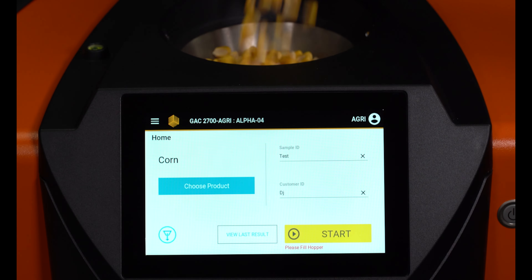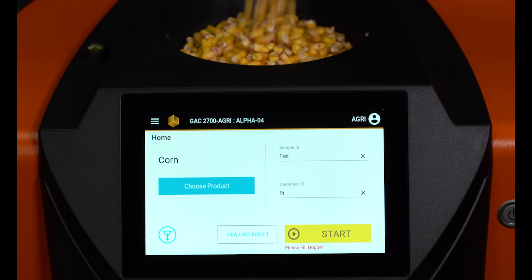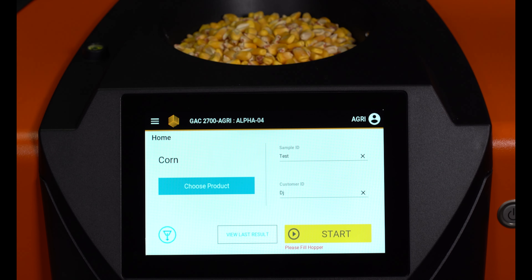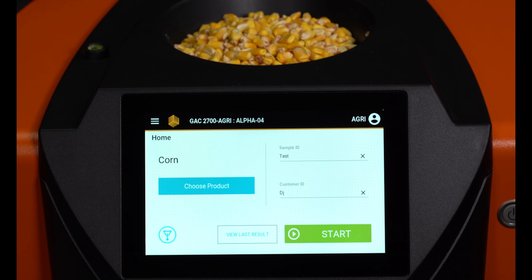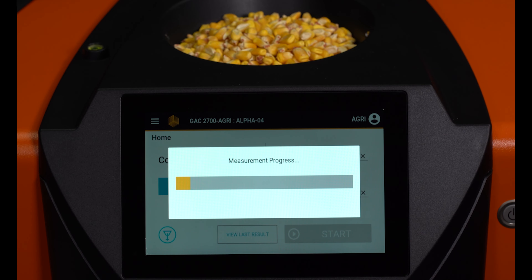Once there is enough grain in the hopper to properly run a sample, the Start button will turn green. Press the Start button to begin.